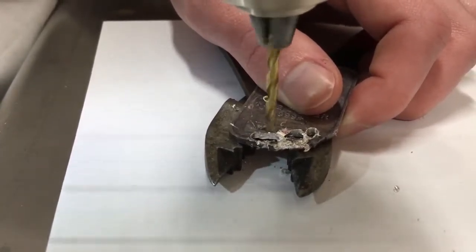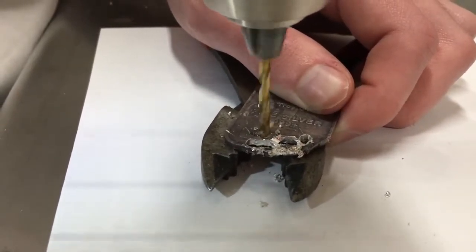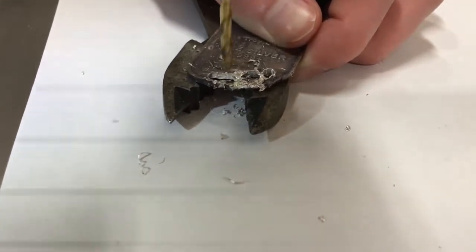I decided to turn the silver bar into shavings by drilling into the bar with a handheld drill. As you will see later, this made the reaction start and end very quickly.